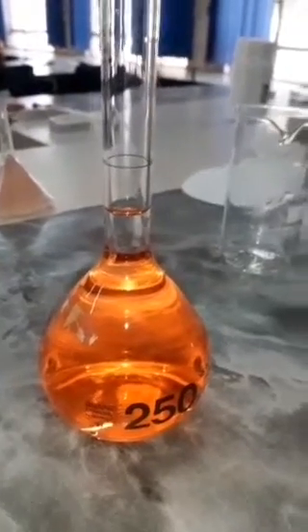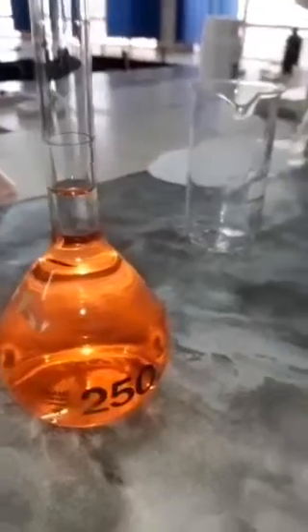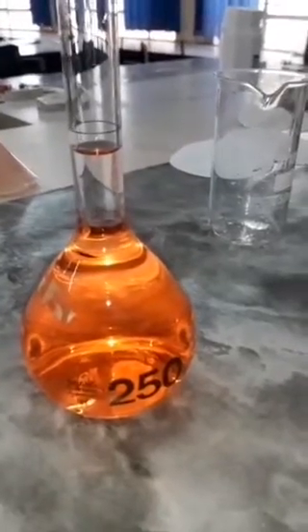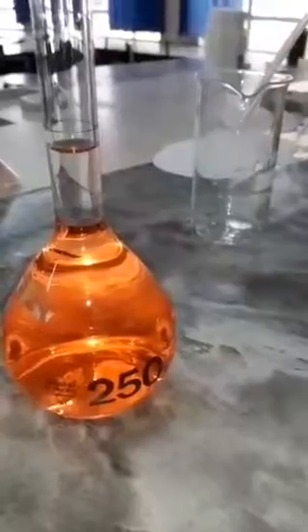So you add some more distilled water. Okay. I'm having trouble with the wash bottle. Okay, so now it's on the mark.